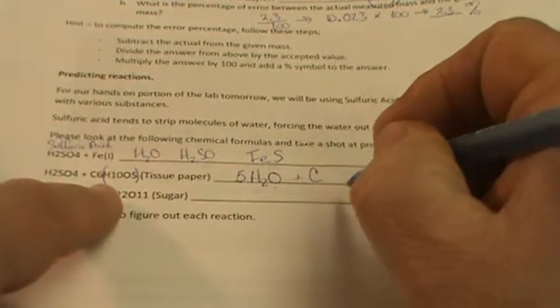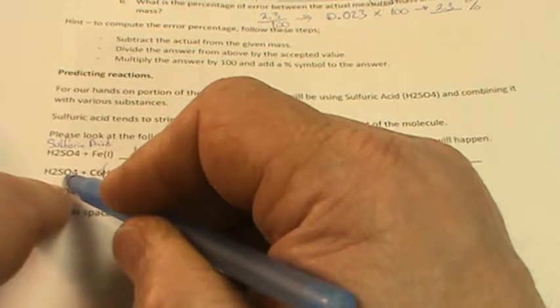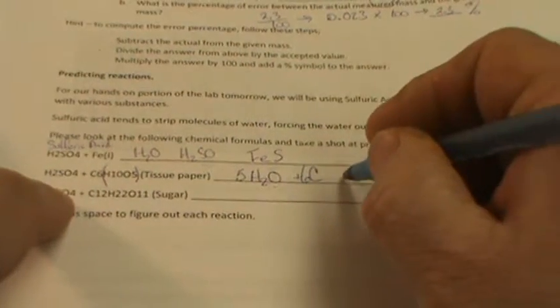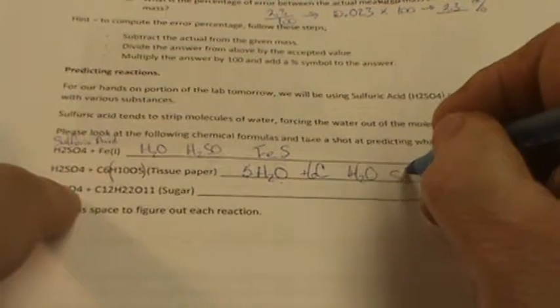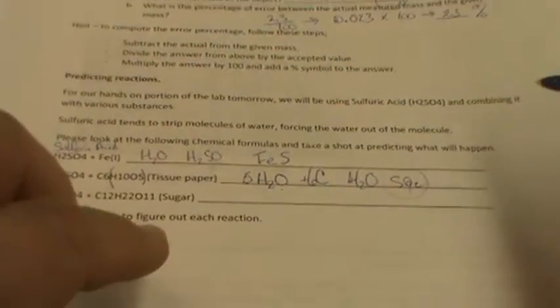We're also going to get carbon left over. We should get 6 carbons. And then with the H2SO4, that could be another water, and an S, a sulfate. So we might get another water, H2O. We might get a sulfide, or an SO2. So there are several things that we can get out of here. And the sulfur product is going to have that rotten egg smell. That's what sulfur smells like.